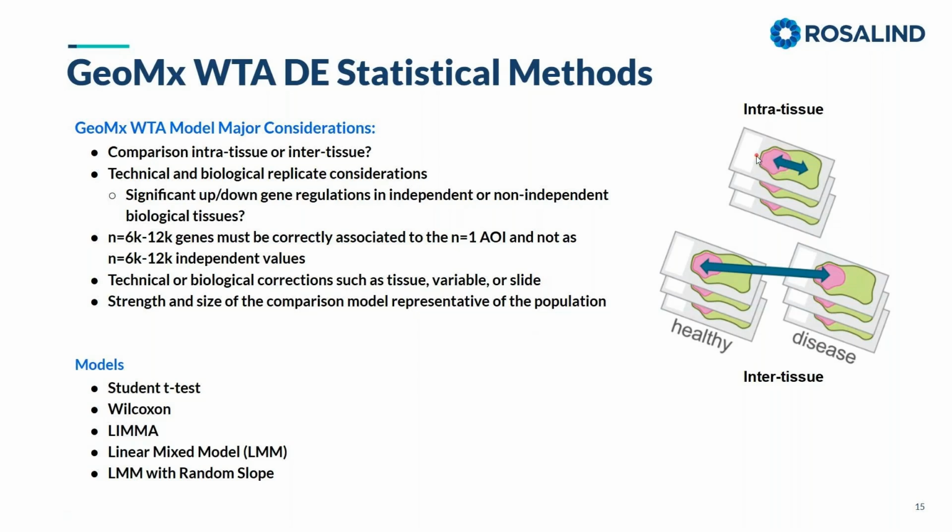This can be really confusing to explain, so we're going to talk about it through the next couple of slides. But that's why spatial is pretty complex: we're not typically taking from all independent tissues like we do for bulk RNA-seq, for bulk single cell, or for cell tissue lines. And so this is where spatial starts to get complex.